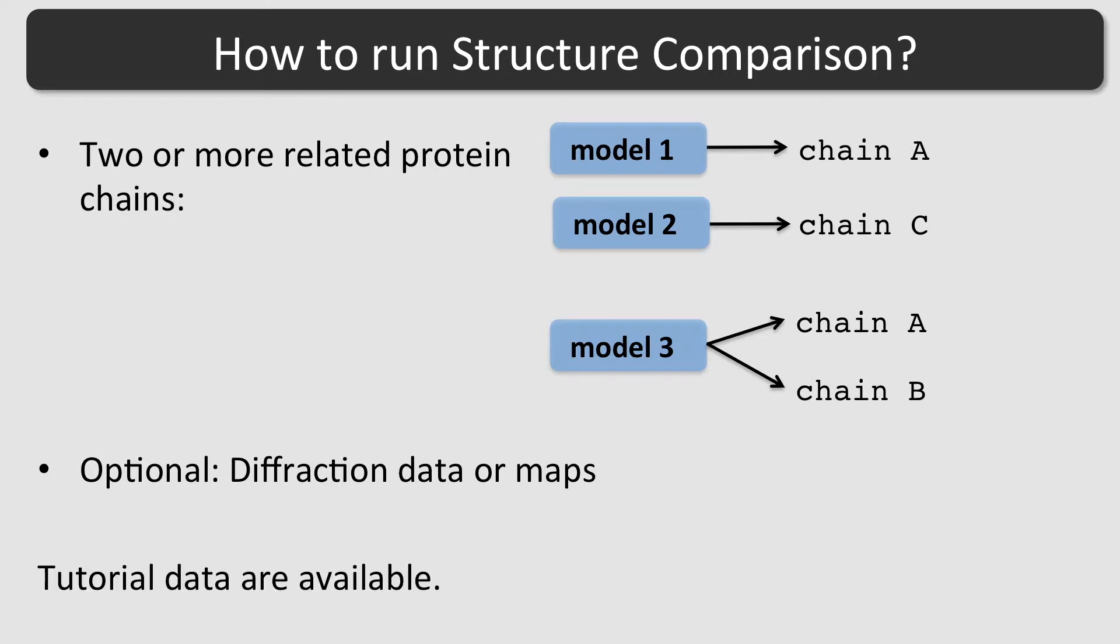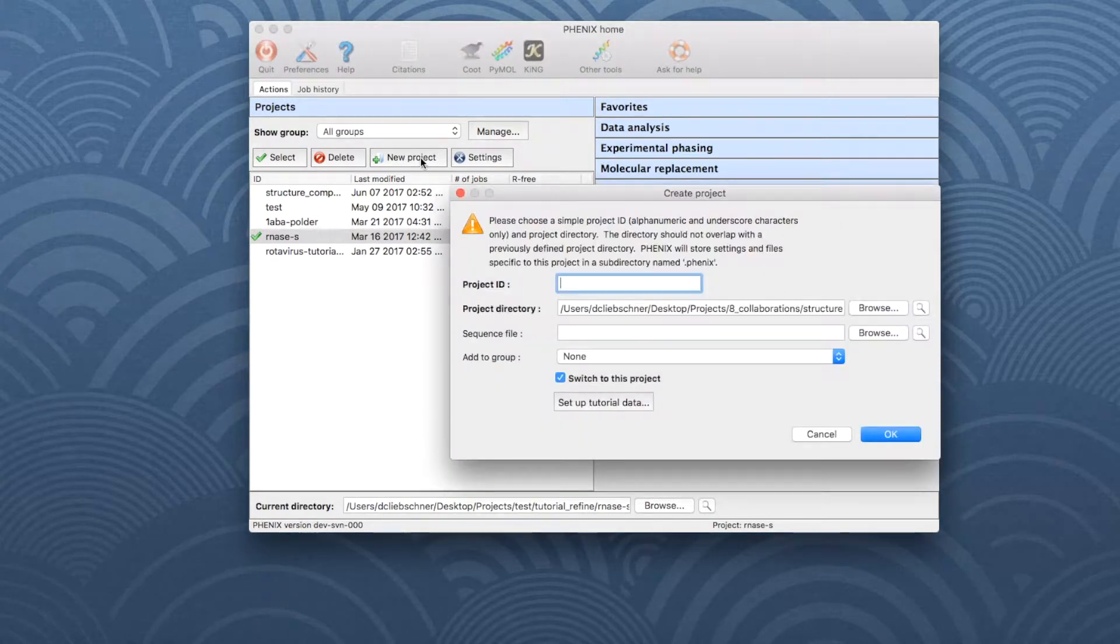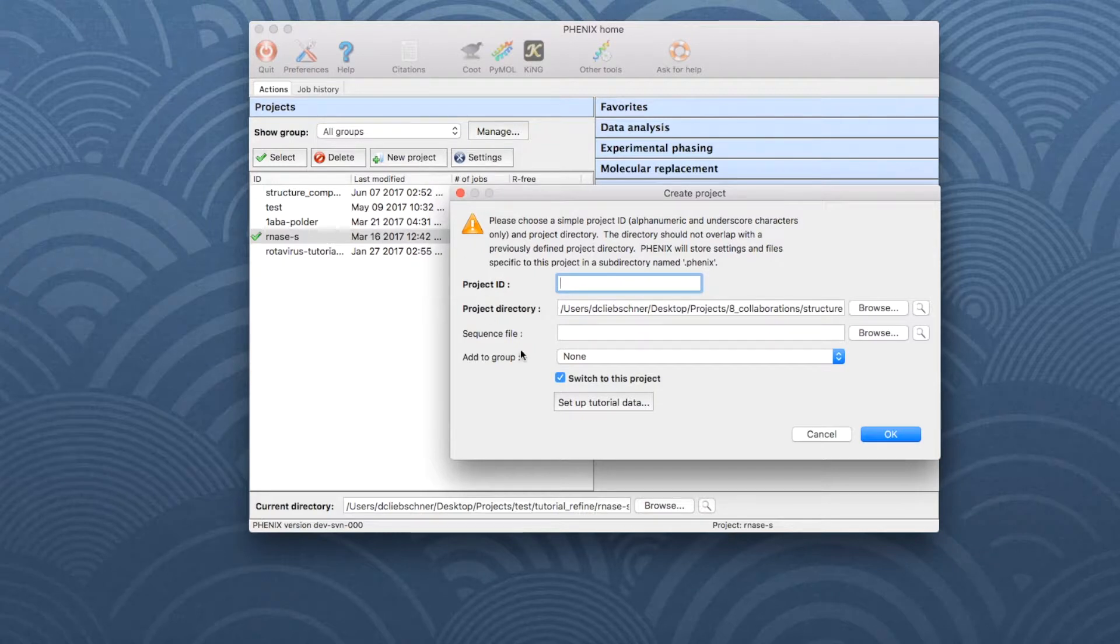The data for this tutorial are available from the example datasets which come with the PHENIX installation. To set up the example data, open the PHENIX GUI and click on New Project, then choose Set Up Tutorial Data.